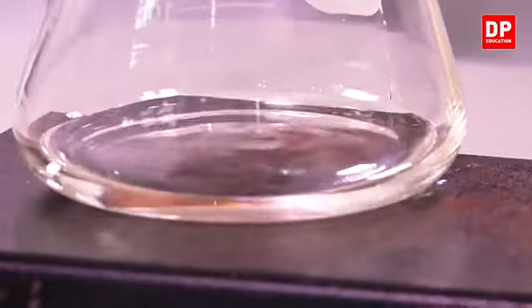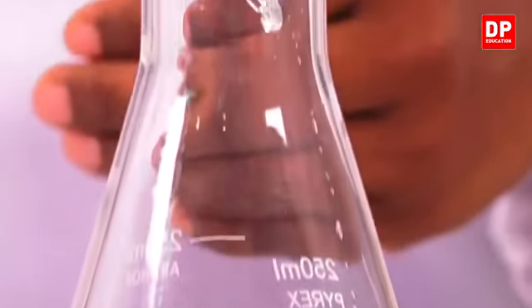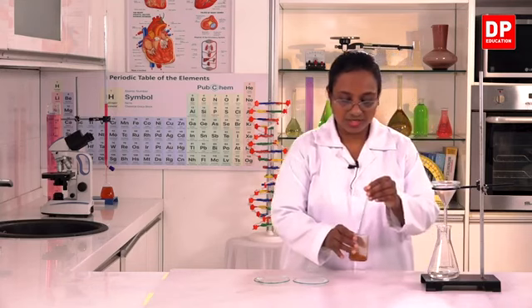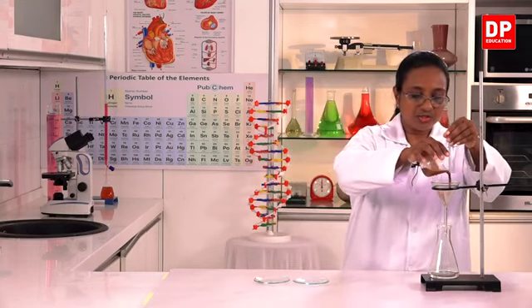So here students, you can see the solution flow. So along the wall of the conical flask, you can see the solution. Just to show you all that it is coming into the flask, I will move it a bit. Here you can see drop-wise the clear solution getting filtered into the conical flask. Again, I will push it back so that they are in contact with each other, and I'll transfer the rest of the solution.